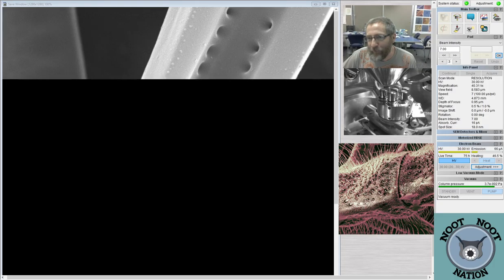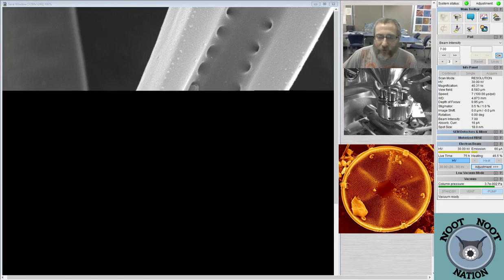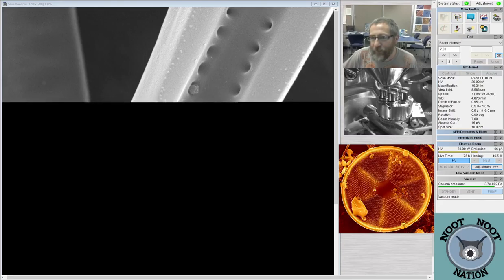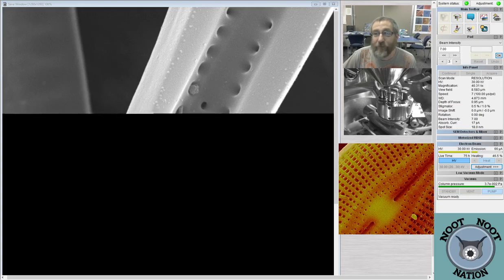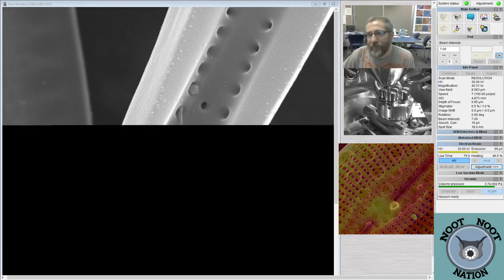What was the honeycomb structure previously? This was way back before. The honeycomb structure that we were looking at was the outside of a Stephanopixis diatom. And then, yeah, maybe Nipponica. I think that's the other one with the non-knuckled connections. That's not this one, right? No. Yeah, okay. The Stephanopixis, you know, the other Stephanopixis.